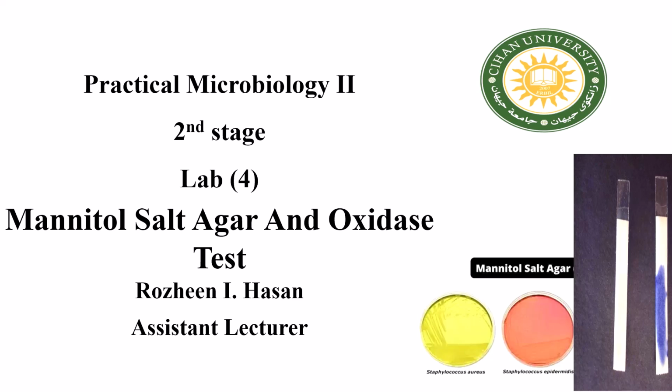Hello everyone, the fourth lab of practical microbiology for the second stage will be about mannitol salt agar and the oxidase test. So we have two procedures we will apply during this lab.